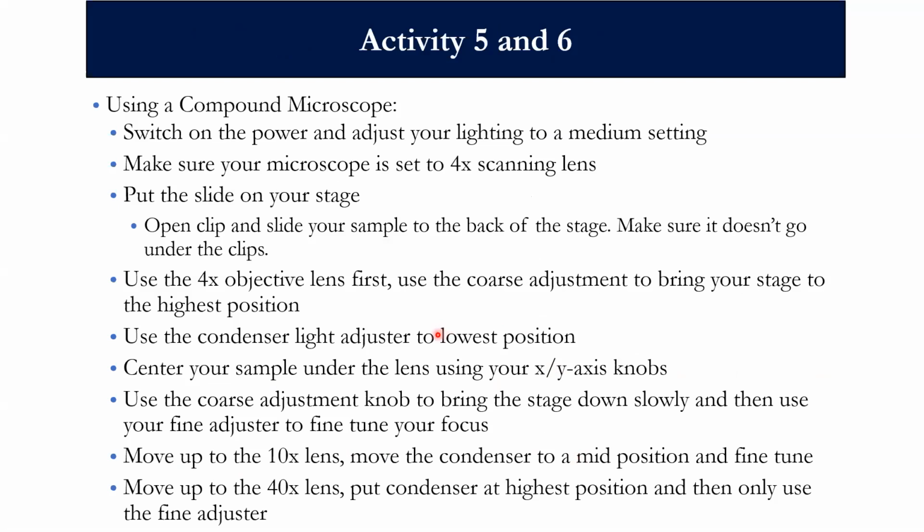So this will talk you through how to use a compound microscope. So keep this in mind when you are doing your activity. So the first thing you want to do is switch on the power and adjust your lighting to a medium setting or so. You want to make sure your microscope is set on the 4x scanning lens.